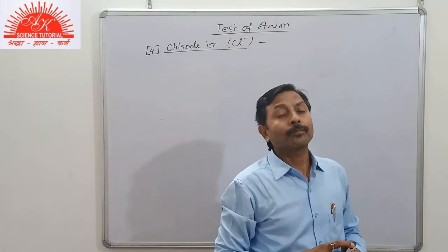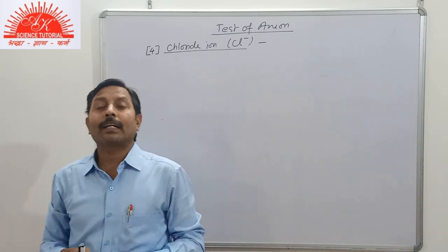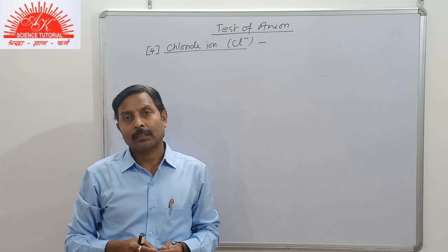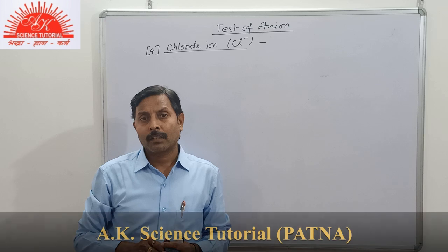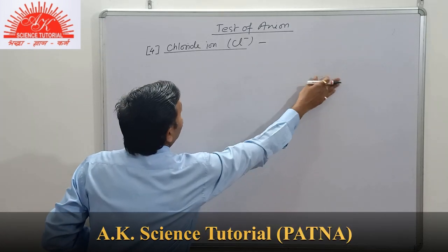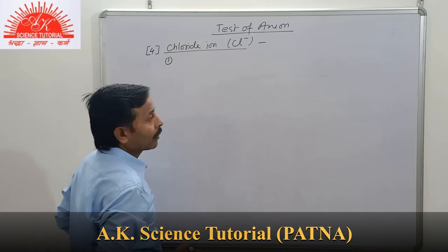Now here, in order to identify the chloride ion we have some tests again. Every time we will identify it, like suppose we take the first test.